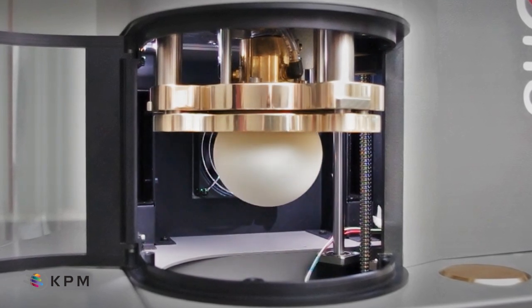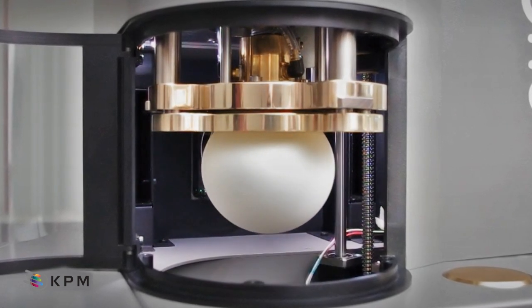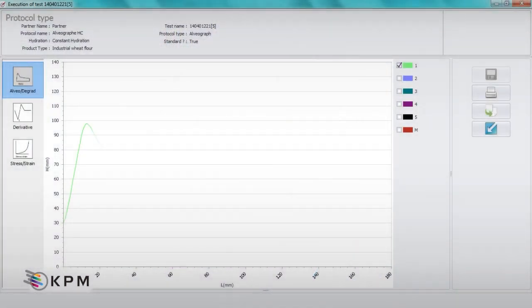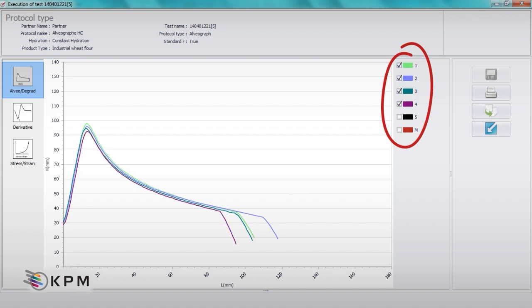The dedicated control software also represents a significant innovation – straightforward, comprehensive and intuitive. It permits test results to be more comprehensively analyzed.